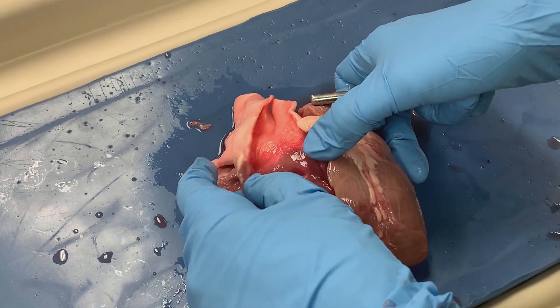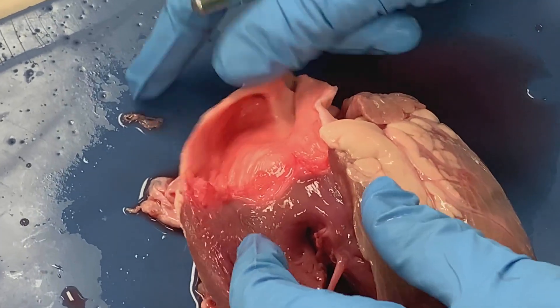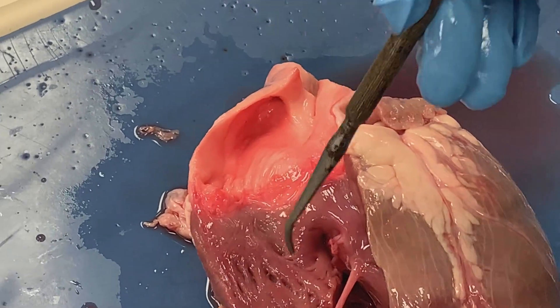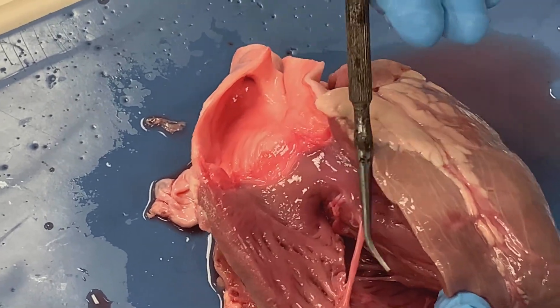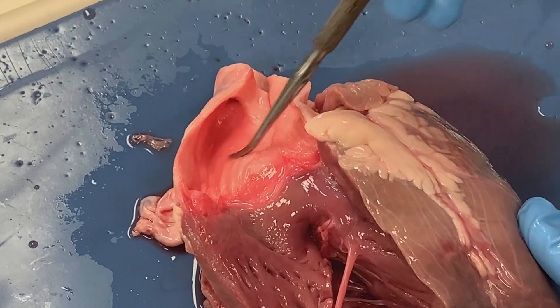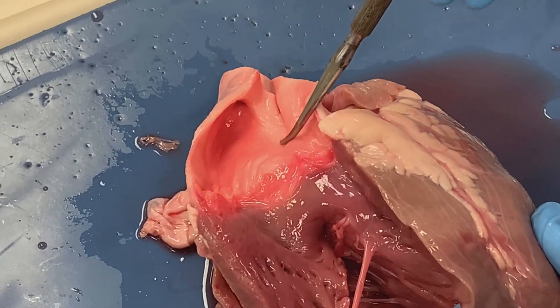So let's open that back up. Okay, so again right ventricle is down here. There is that moderator band that we looked at, and we can now see the inner surface of our pulmonary trunk.